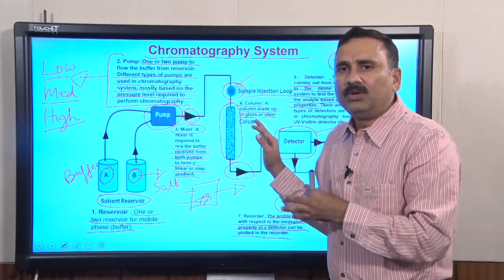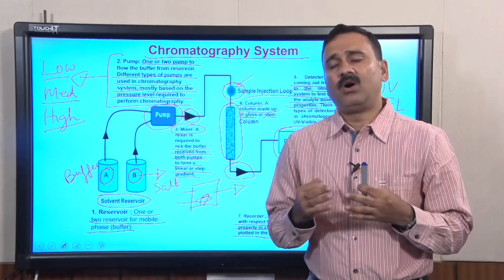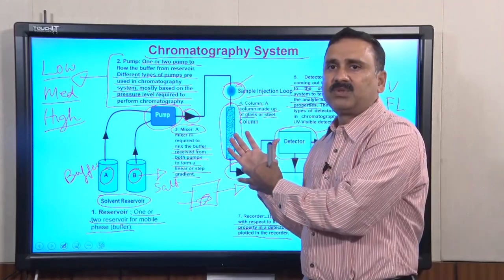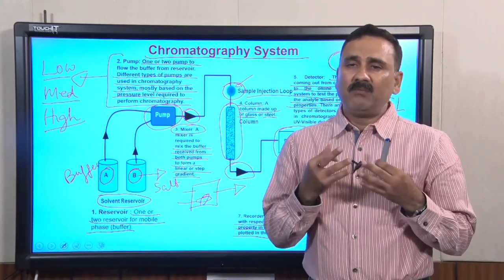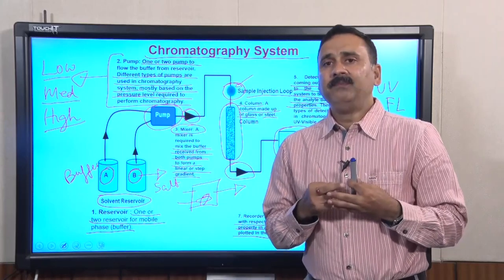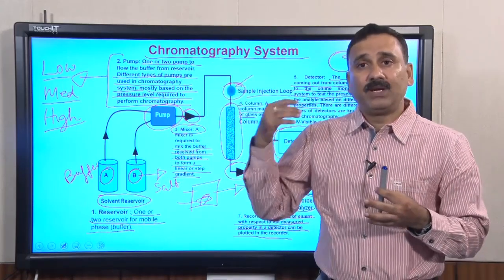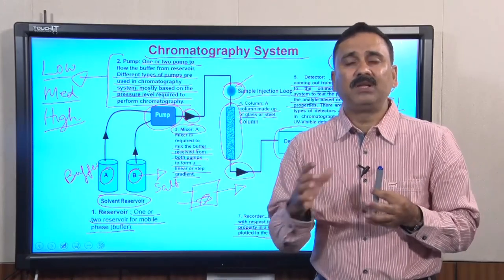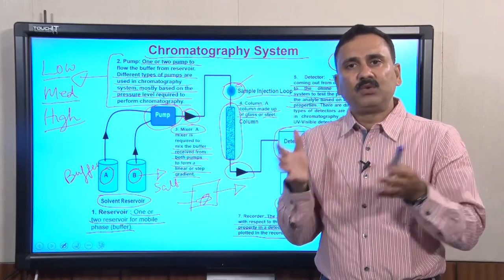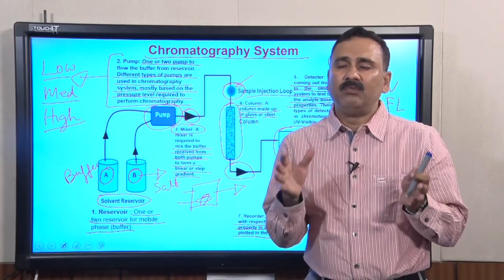This is the theoretical explanation of a chromatography system, but when you see a chromatography system in the laboratory, its operation is very different from this description. For this purpose, we have prepared a small demonstration of the chromatography system present in our laboratory. We will show you how to operate the chromatography system, how to connect the column, connect the loops, inject samples, and how to use the software interface to operate the machine.